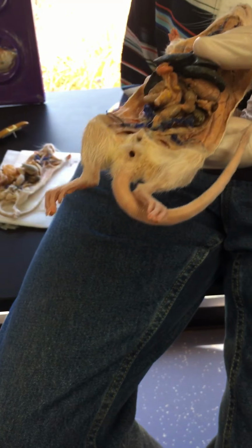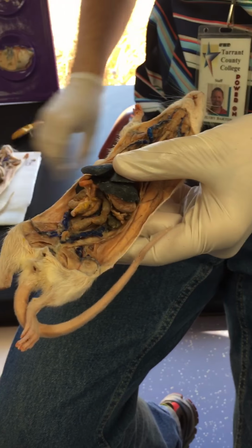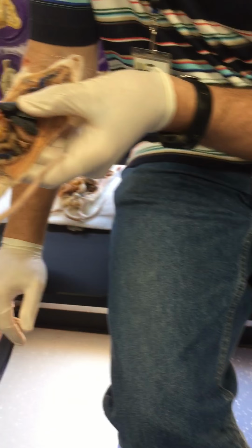Can somebody get me a pointer out of one of those drawers over there that's marked with a blue? Because my big fingers pointing to these little bitty structures might be a little bit difficult. There should be like a metal pointer or scissors or something. Just grab one of those, Cynthia. Yeah, that'd work. Thank you, ma'am.